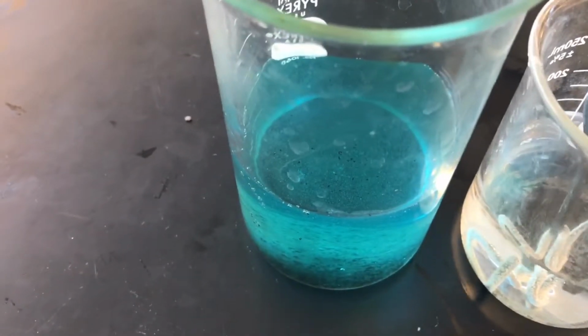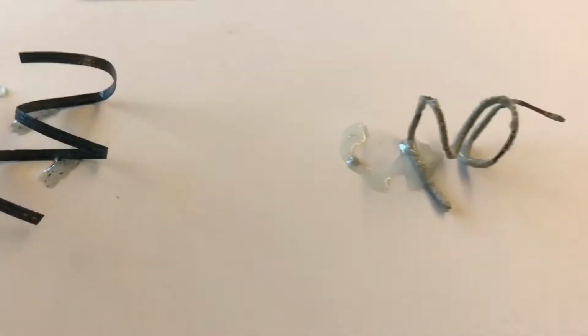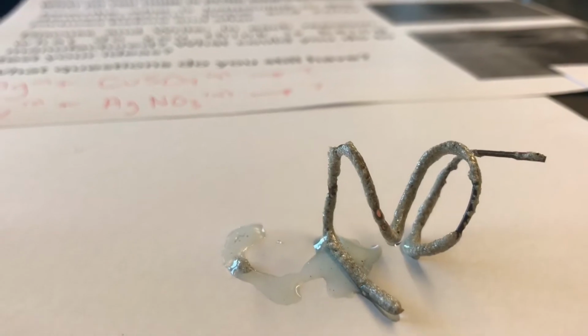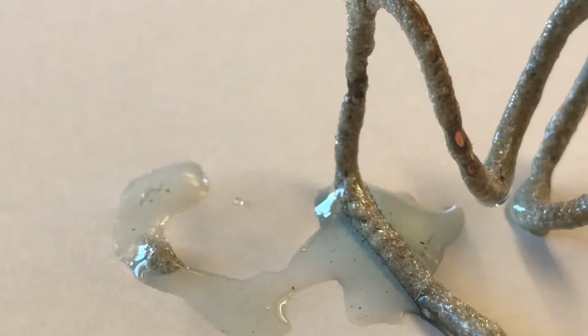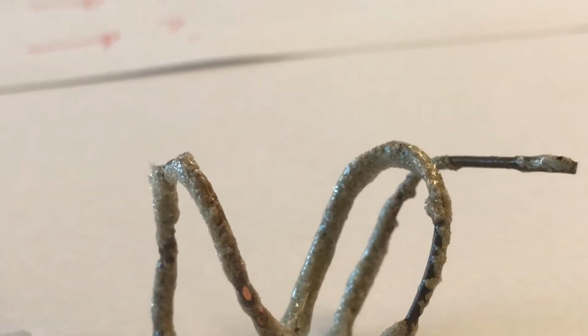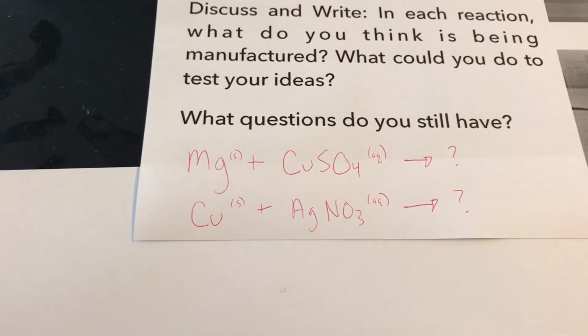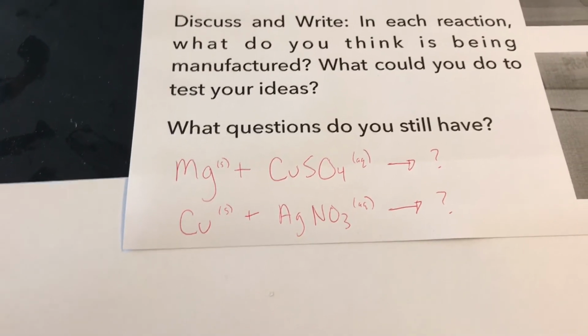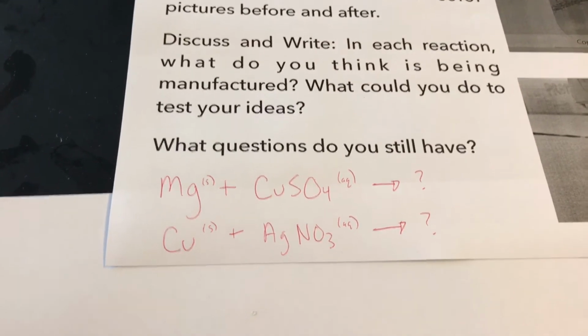Okay? This one is pretty much crazy looking now. It looks almost like a caterpillar. And so I'm going to take out, hopefully I don't break off a whole bunch of it, but here you go. All right, this is our after picture now for the copper wire. Take a look at that substance that's growing on the outside. Again, take a look at our reaction. What do you think is happening, and what do you think is being manufactured? So watch the video again, if you have to look at the before, the during, and the after.